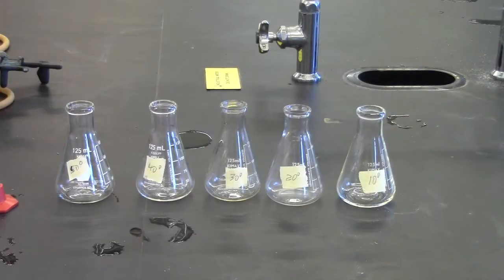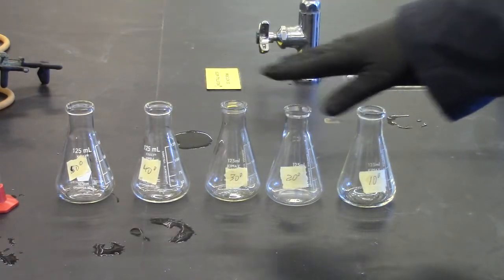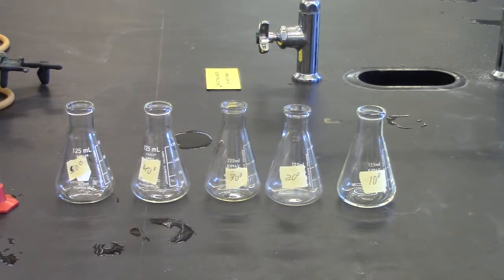Part B: Collecting Samples. Clean and label five 125 milliliter Erlenmeyer flasks. You can label them 50, 40, 30, 20, and 10 degrees Celsius.